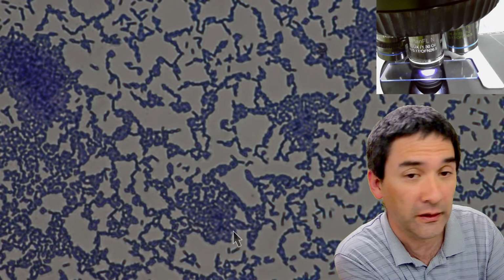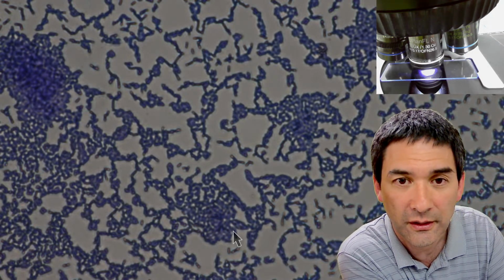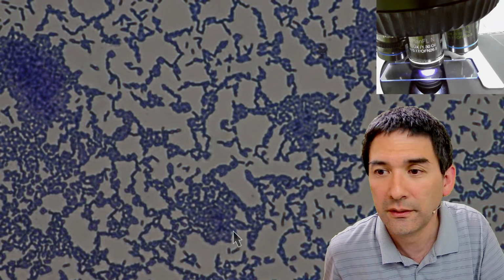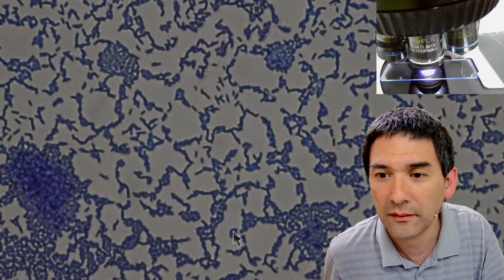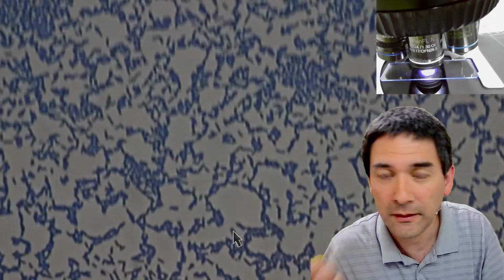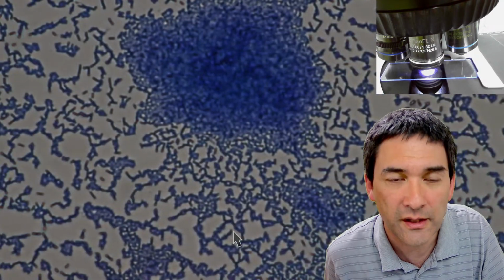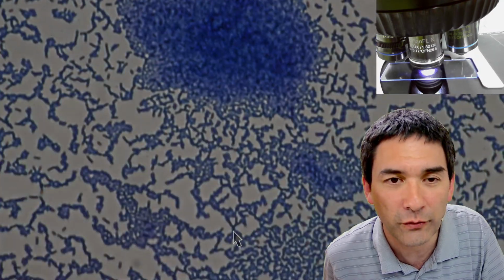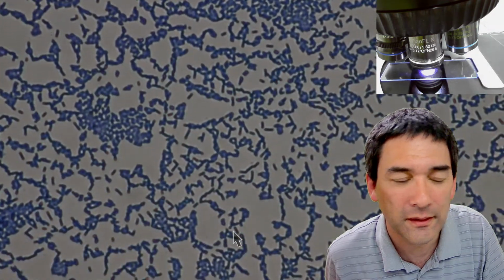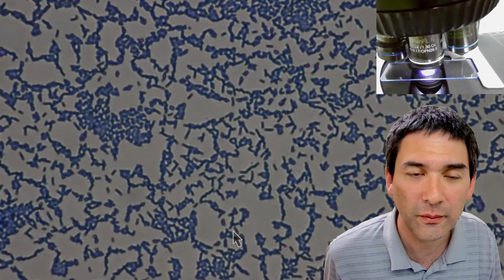By the way, this is bright field. I've removed the filter, okay? So I just want to make this clear. These are now stained E. coli bacteria. You can see that some of them are still clustered a little bit around. As I picked it off from the colony, it did not dissolve all of them yet. So that's why sometimes there are those large clusters. But I think you're able to see quite well that those bacteria have now been stained with methylene blue.